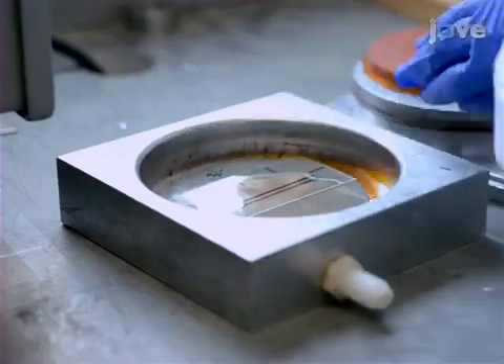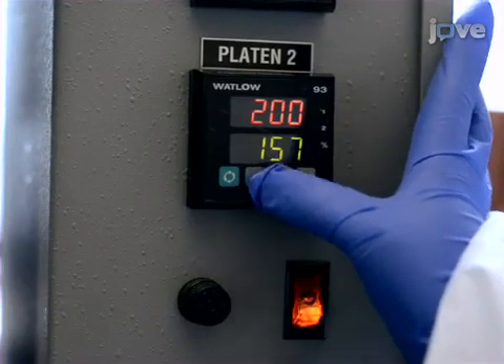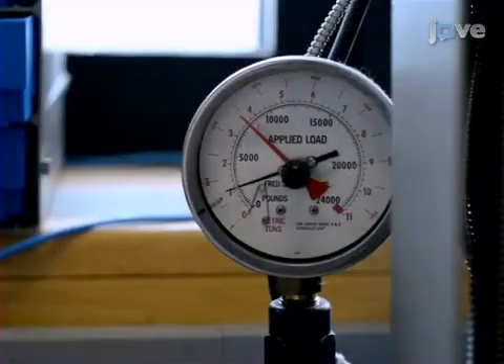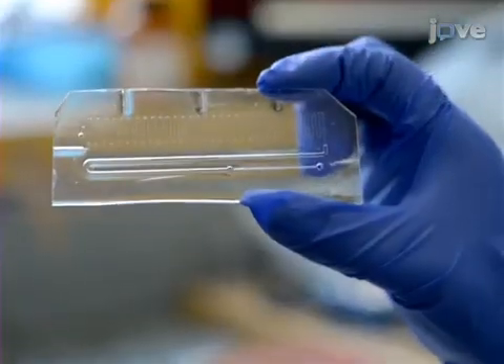Apply pressure to 1000 psi for another 10 minutes. Next, wearing thermal gloves, remove the plaque and mold from the hot press, then remove the plaque from the mold before it cools down.